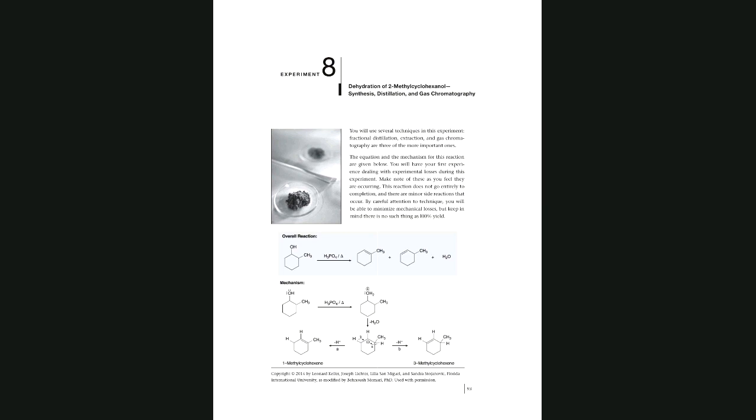You could see the reactant and product. Do you expect different boiling points? What makes the reactant have a different boiling point than the product? Can you tell me if the reactant is expected to have a different boiling point from the product, or are we just assuming that it is going to be different? What determines the boiling point? Or what affects the boiling point?